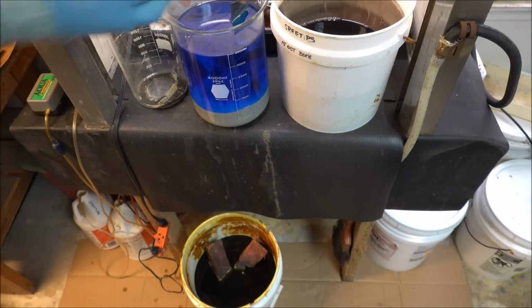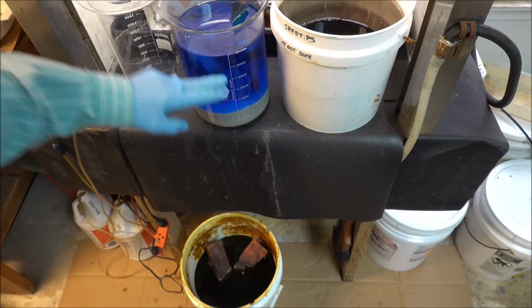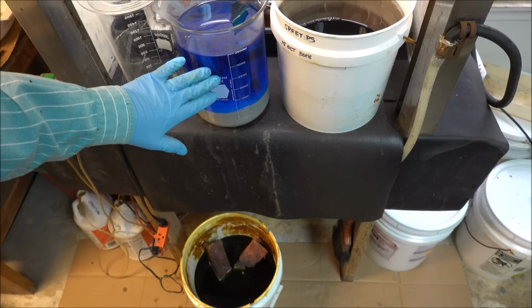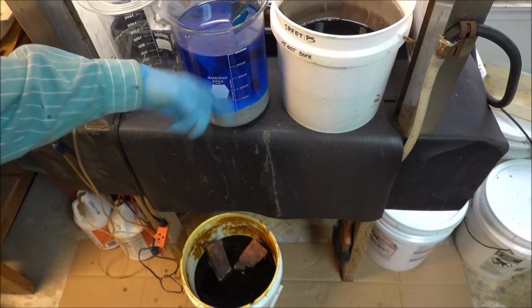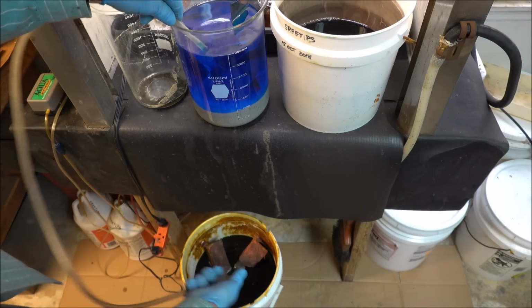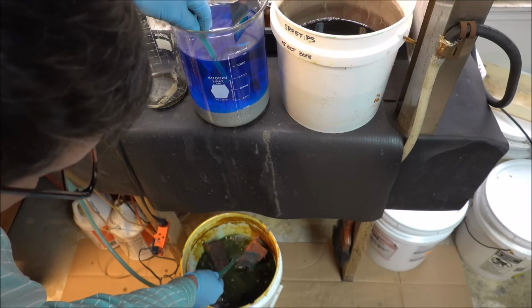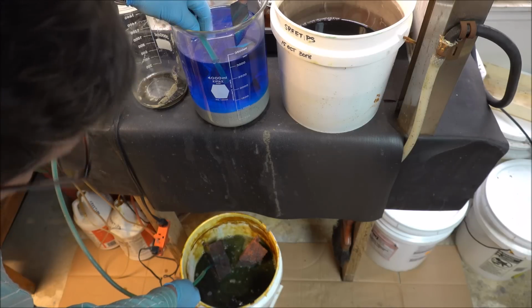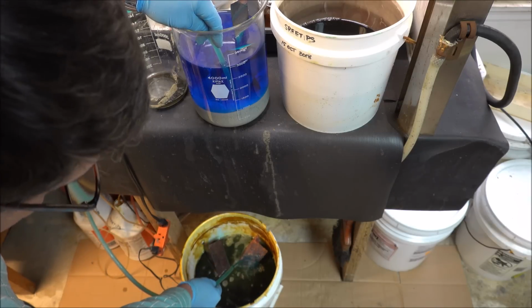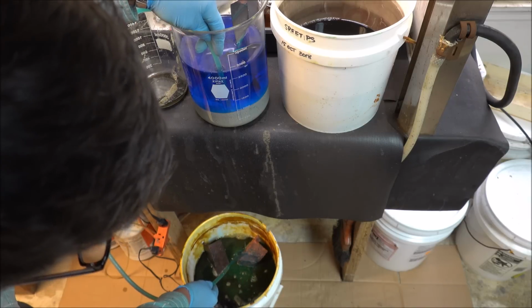Alright, I've got some silver here that I cemented out with copper. This is a waste solution in this beaker up here. So this is not part of this refining, the jeweler's waste. This is something else, but I want to get this blue liquid that's full of copper down into my waste treatment bucket. So I got a tube full of water here. I'm going to siphon it off now down into the bucket, my waste treatment bucket that's full of iron. The copper in these solutions will cement out on that iron, and then what I'll end up with in the bucket is iron in solution.